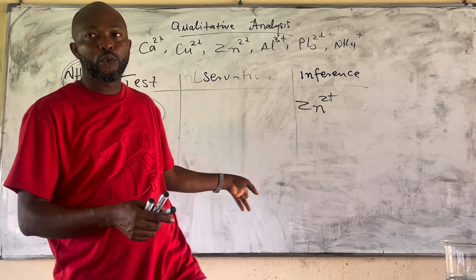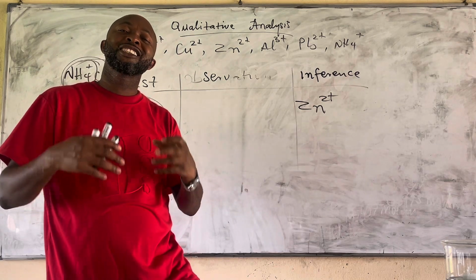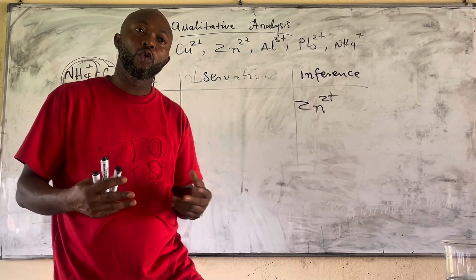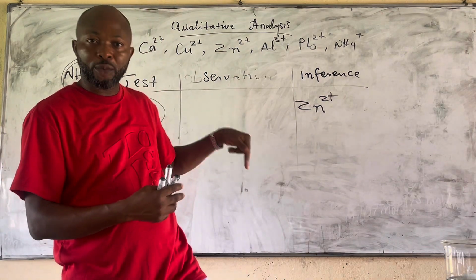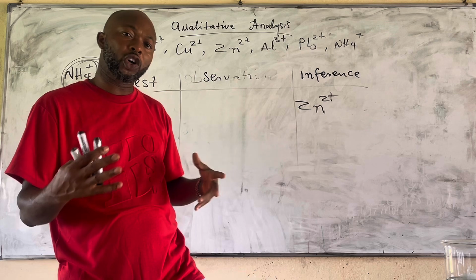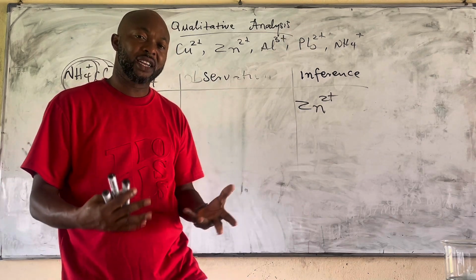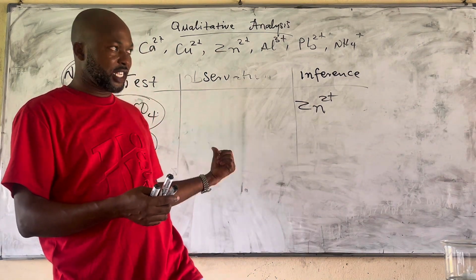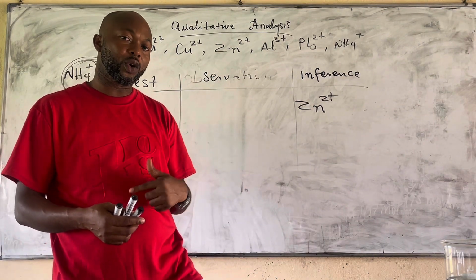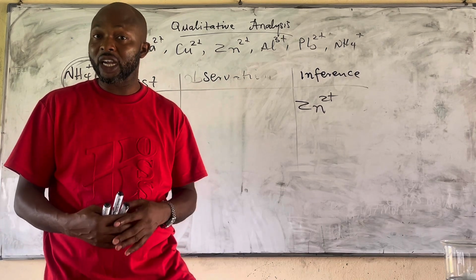And this same sample, when we add concentrated hydrochloric acid, gives us dense white fumes, which shows that that substance is ammonia. We are going to see that practically, or maybe I'm going to have a practical live class where, as I'm saying it, I show you how it is done. So that when you encounter such challenges, you will know exactly what to do.